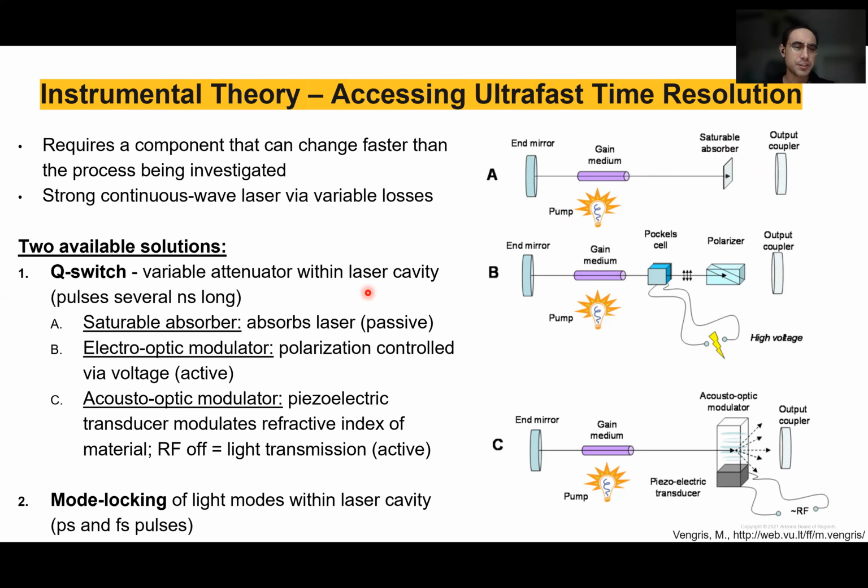Then you can also have an electro-optic modulator, which uses a polarization controlled material. You can control the polarization using voltage.